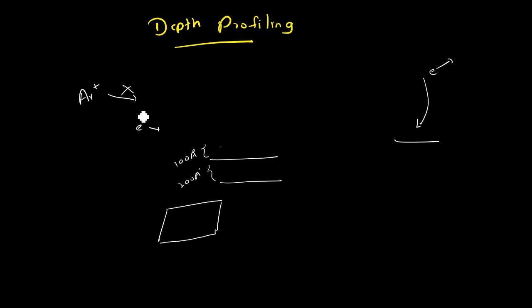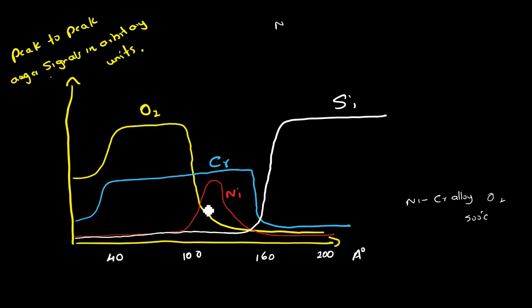So we have used electron bombardment and we stop it, and we use argon plus to remove the first layer, and then we analyze again. Again we peel off another layer. Likewise we do the profiling. So this is the data which we have.